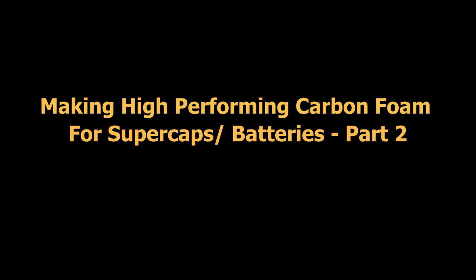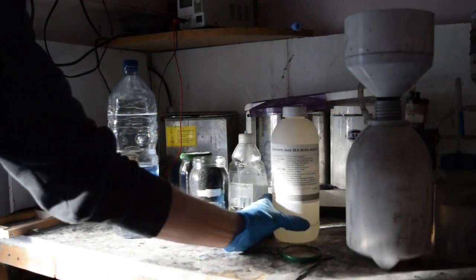Welcome to Making High-Performing Carbon Foam for Supercapacitors Batteries Part 2. This is where I show you how to process that carbon that we've made in the shed.